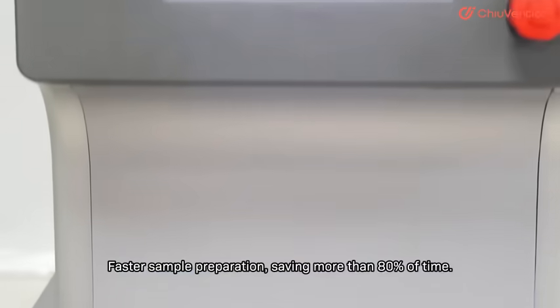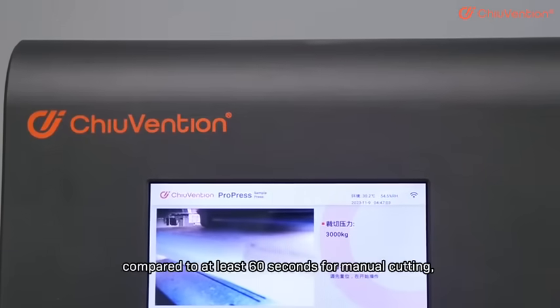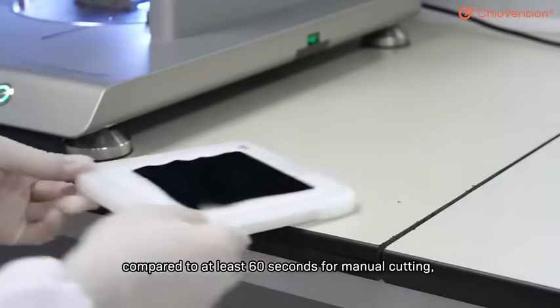Faster sample preparation, saving more than 80% of time — the ProPress presses samples in several seconds per operation, compared to at least 60 seconds for manual cutting.